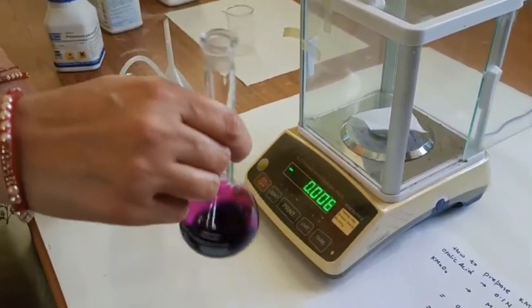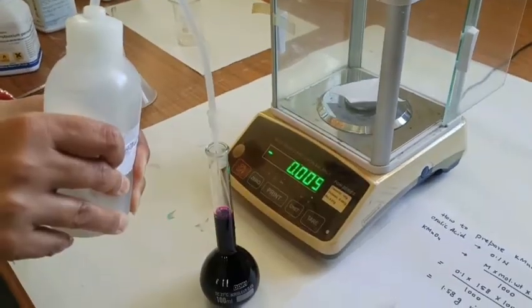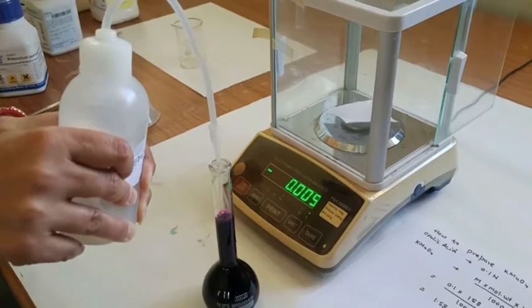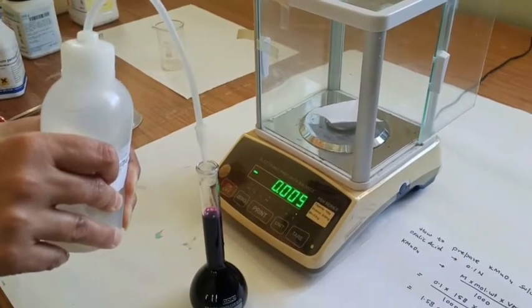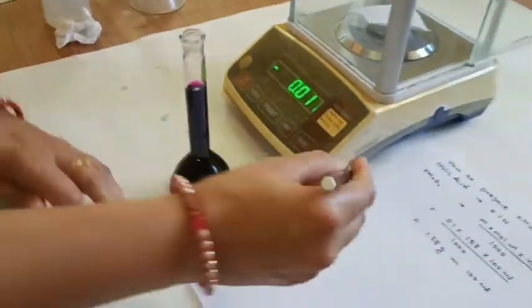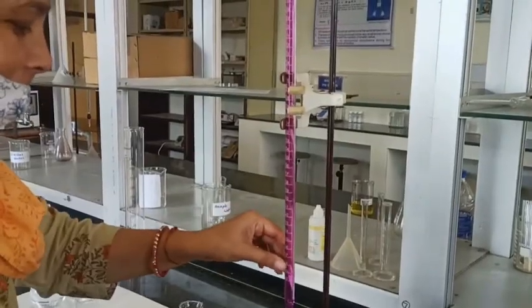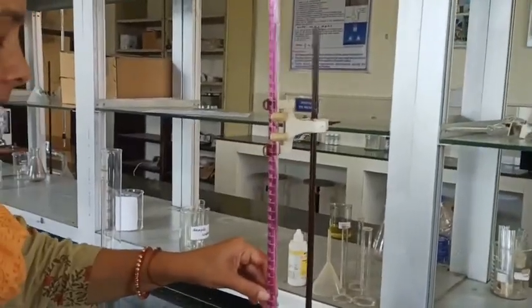Now I dissolve it thoroughly. Make up to 100 ml. This is a 100 ml flask. Here you can see the lower meniscus, right? So this is 100 ml. Now I transfer it to the burette. I'll just rinse it first.